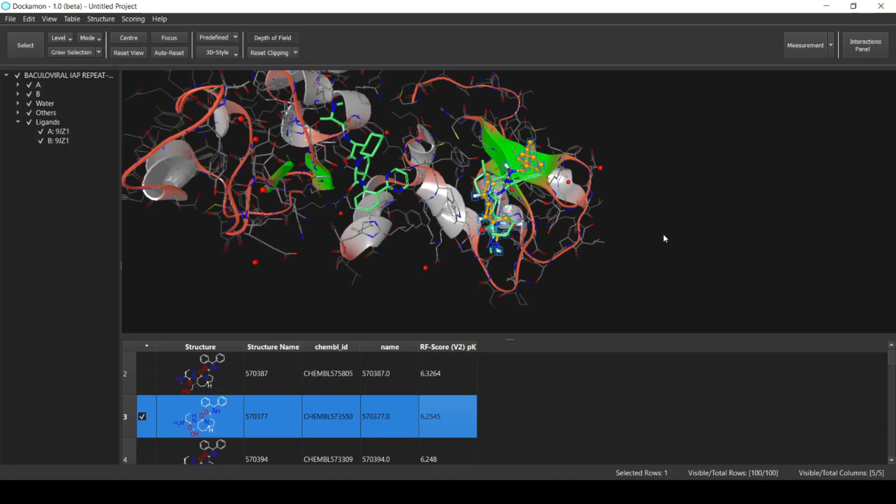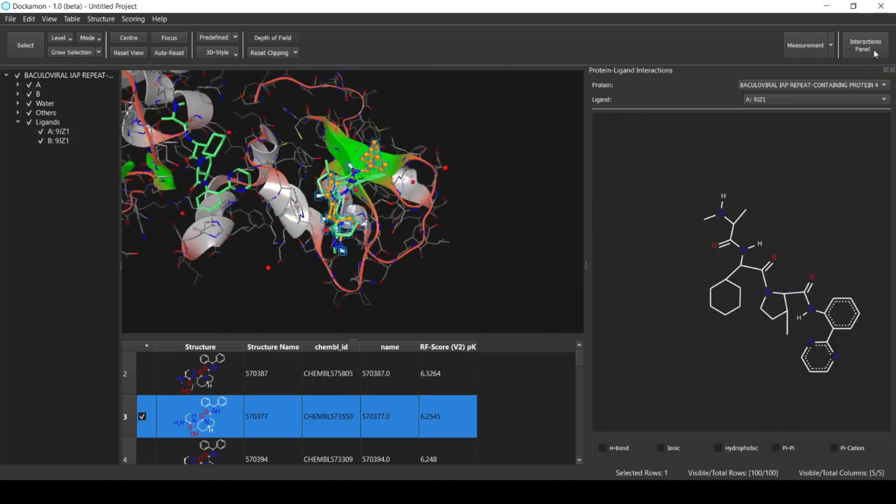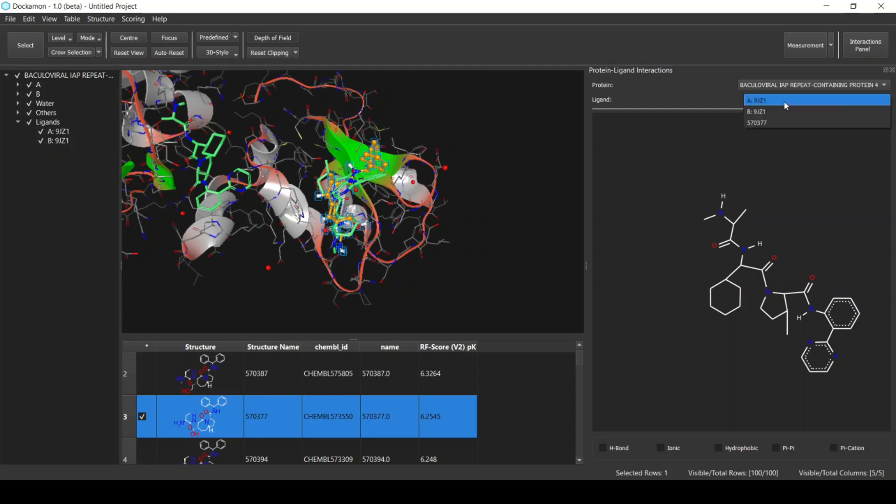You can also see the ligand-target interactions from the Interactions panel. From this panel you can select the protein and which ligand you want to see. It could be a native ligand of the protein or a ligand from the table.